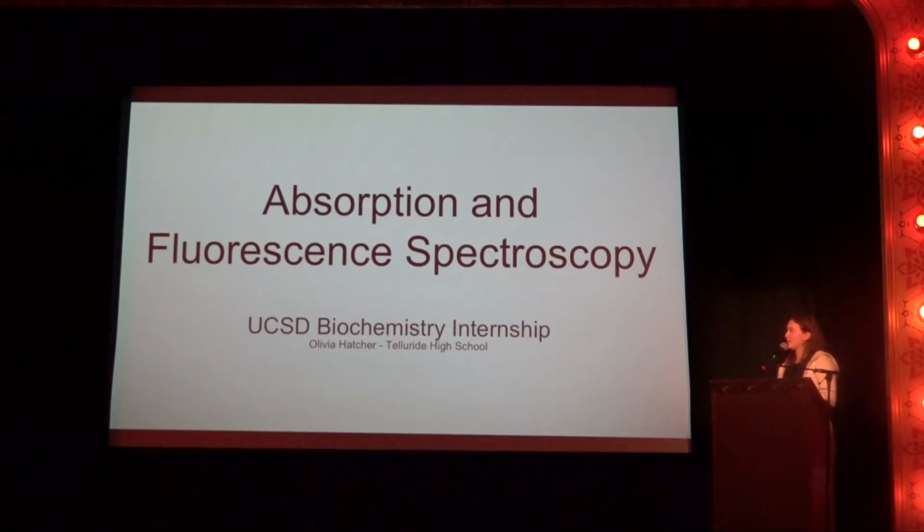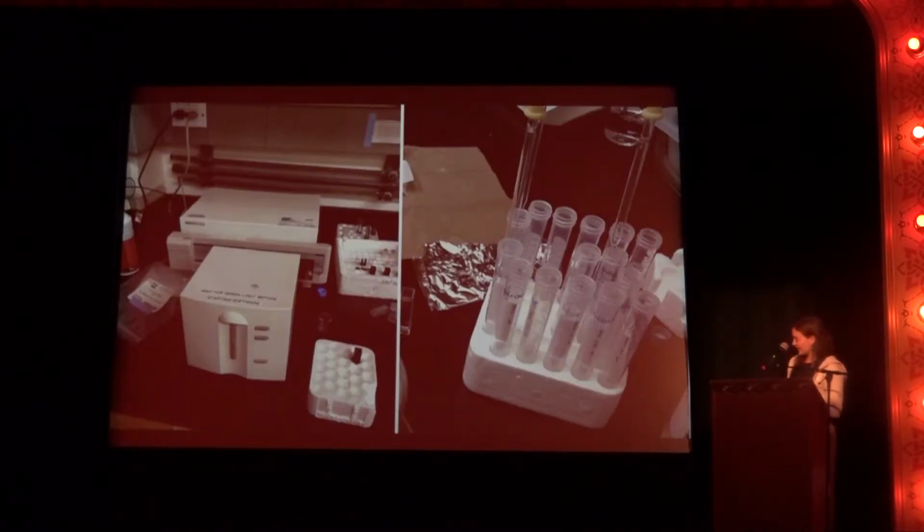Hi everyone, I'm Olivia Hatcher, and as the slide says, I did absorption and fluorescence spectroscopy at UCSD in a biochemistry lab. Okay, so over here on the left is the UV absorption machine.